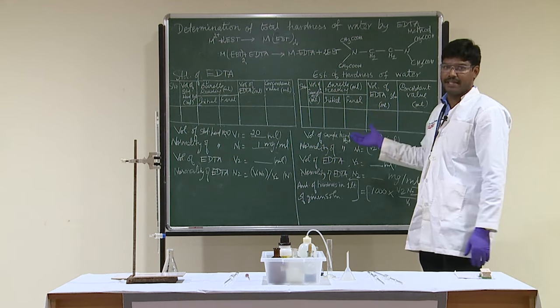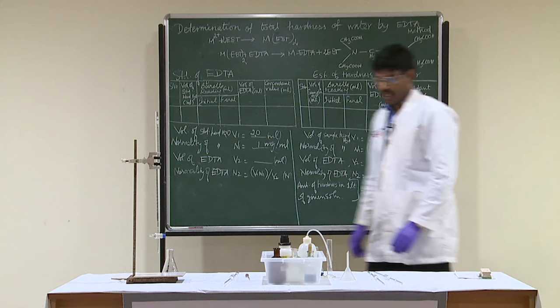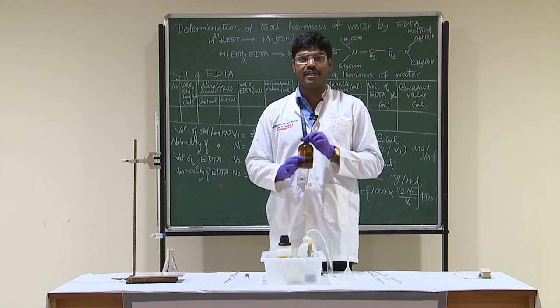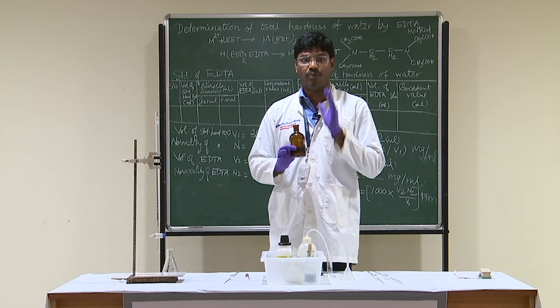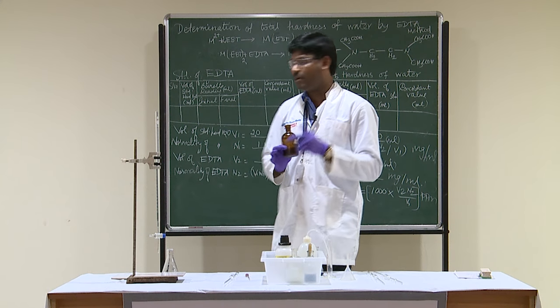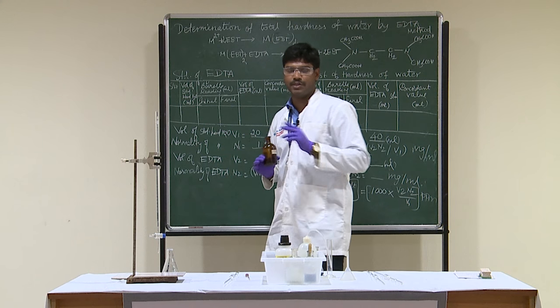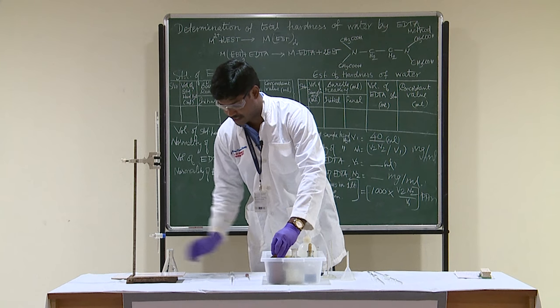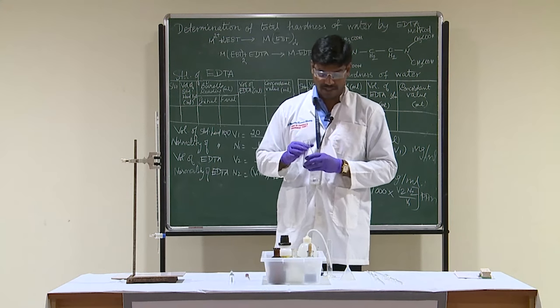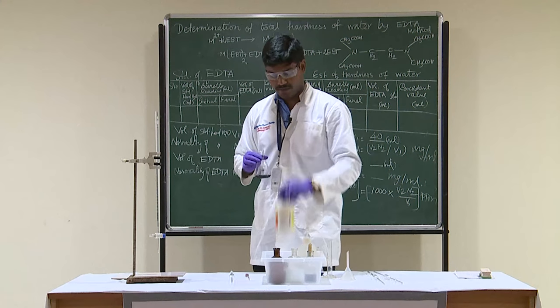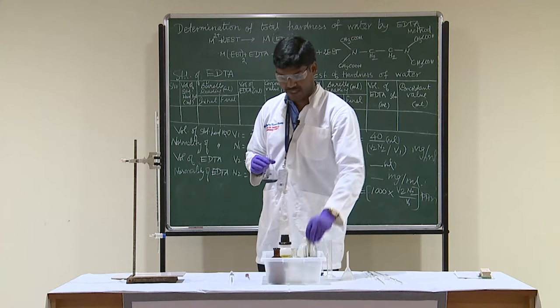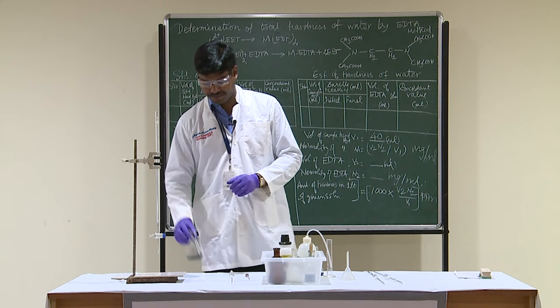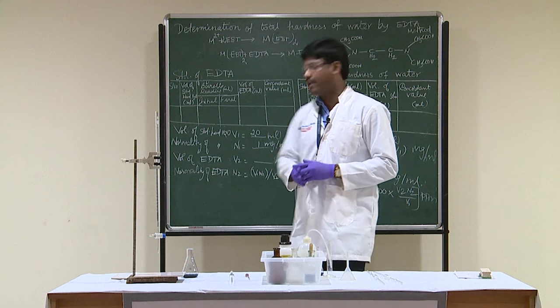Now for the second titration — estimation of hardness of water. The water sample is given and its hardness is unknown. Take 40 ml of the sample using a pipette into a conical flask. Note: for standardization of EDTA you took 20 ml, but for this titration take 40 ml. Add 5 ml of buffer and 2 drops of EBT. Fill the burette again with EDTA and titrate. When you get the steel blue color, that is the end point — note down the value.